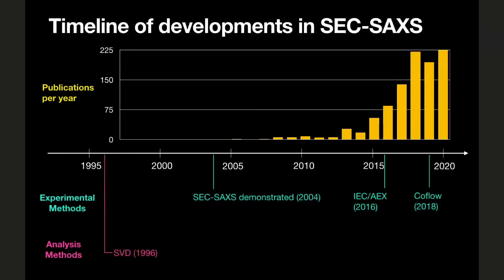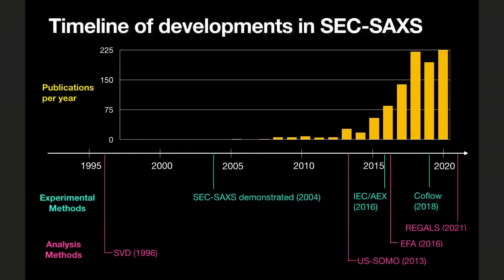One of the most important techniques we use in SEC-SAXS is called singular value decomposition. That's actually quite an old tool from linear algebra, but it was first used for SAXS data in the mid-90s. And then there are also analysis techniques that are really tailor-made for SEC-SAXS.